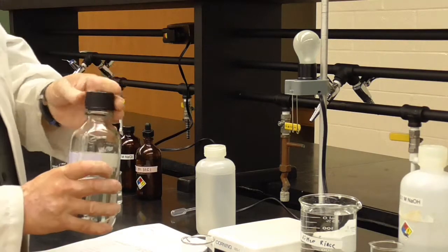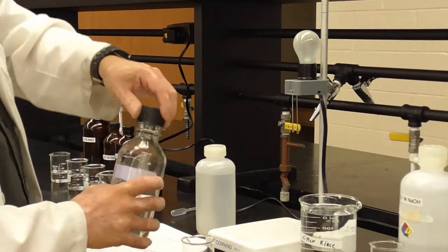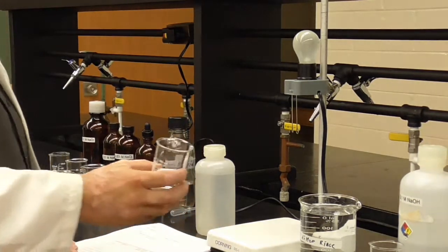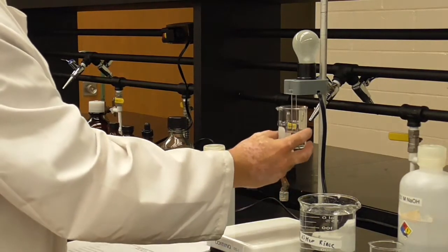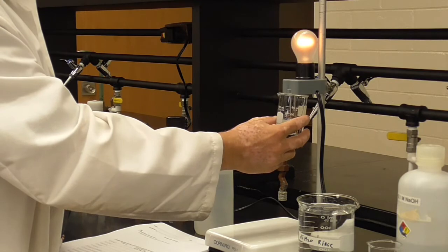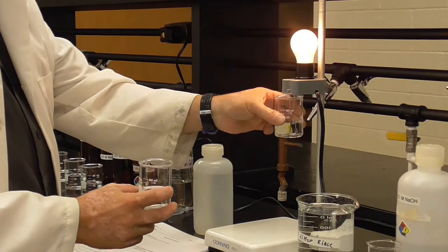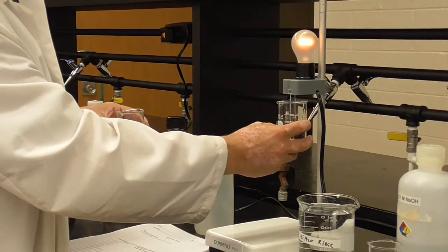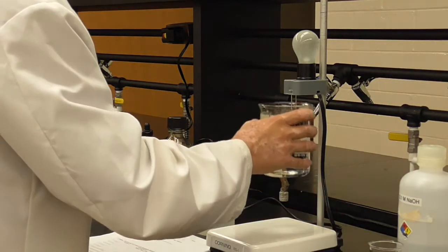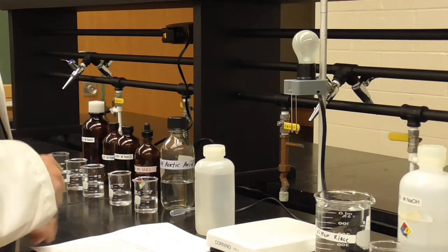All right, now we go to acetic acid, 0.1 molar again. So we saw what 0.1 molar hydrochloric acid looked like, pretty bright light. This is also an acid. Acetic acid is the stuff that's in vinegar. Same concentration. Let's see how this one will do. See quite a bit of a difference. Yes, the light bulb's turning on, but not as bright as the hydrochloric acid was. Let's see the difference there. Okay. So again, the nature of what the compound is, even if they're at the same concentration, just its identity, will affect the ability to conduct electricity or not.